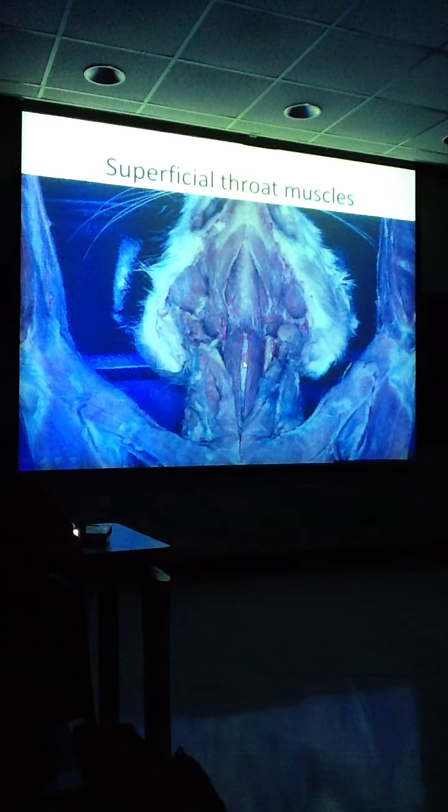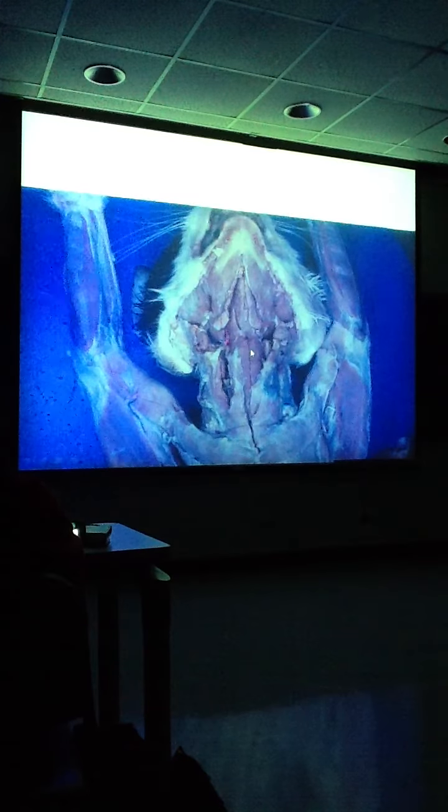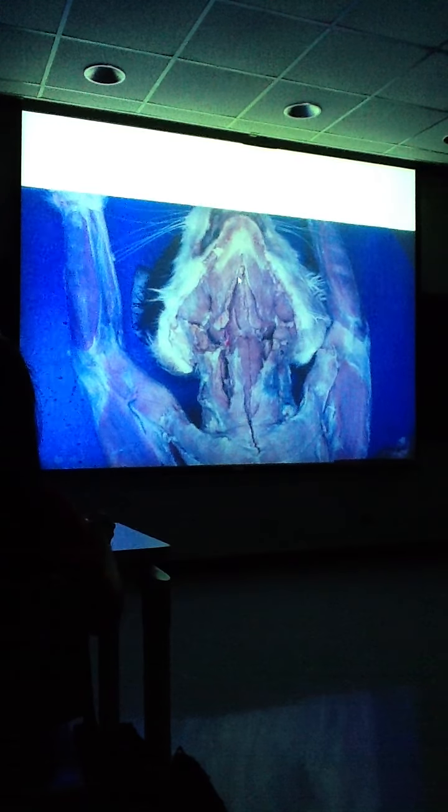Cleidomastoid. Mr. Gilmore, just tell me what the one is that's in the middle that doesn't move. It's right there in the middle. His name is cricothyroid. Mr. Gilmore, hold up. You got something reflected here. The one that's reflected, his name is mylohyoid.